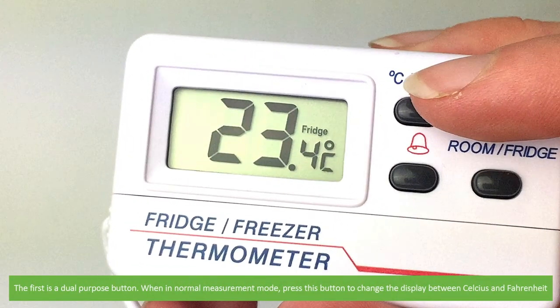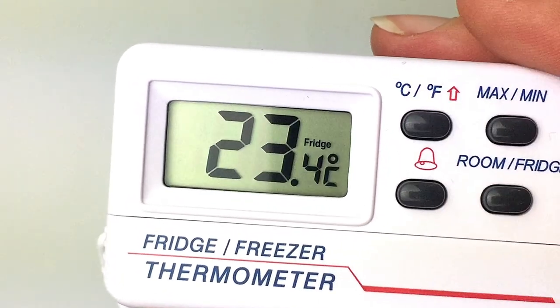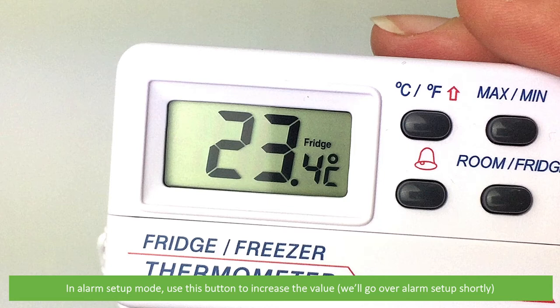The first is a dual purpose button. When in normal measurement mode, press this button to change the display between Celsius and Fahrenheit. In alarm setup mode, use this button to increase the value. We'll go over alarm setup shortly.